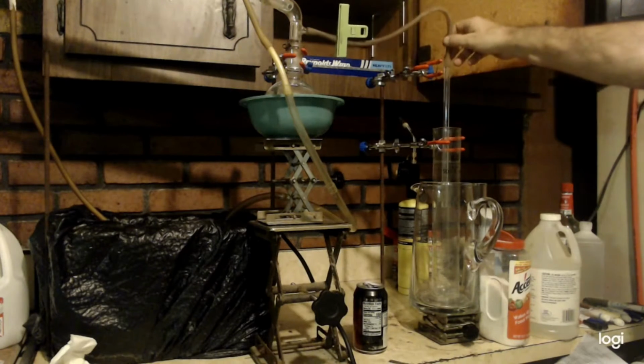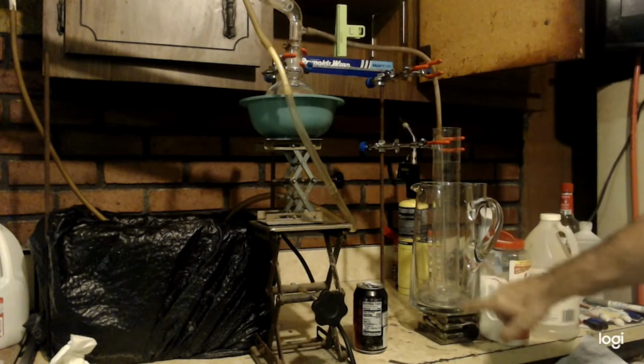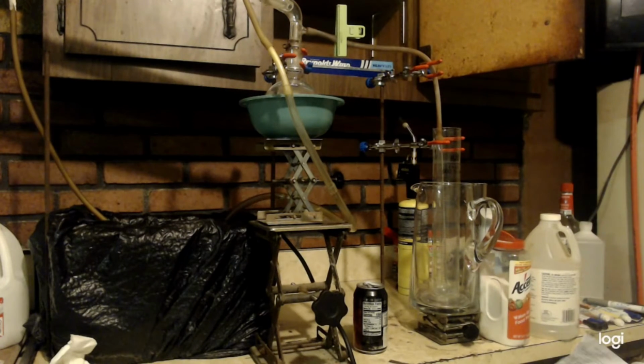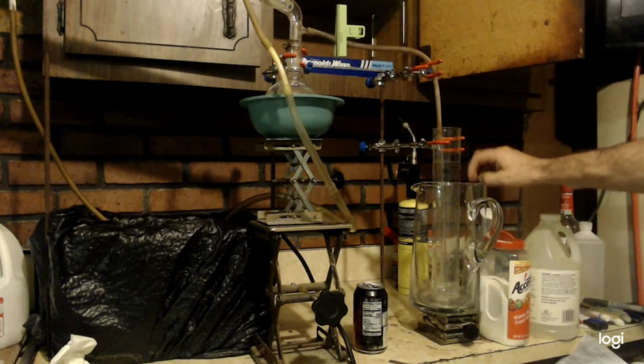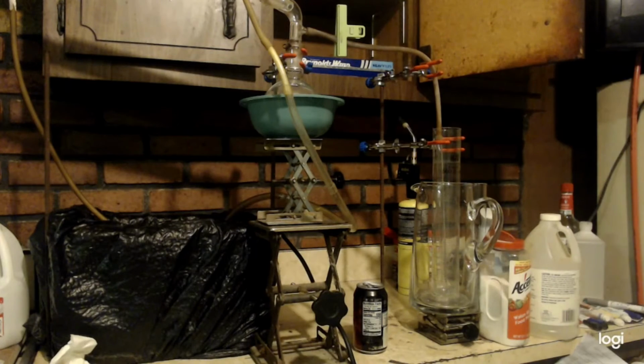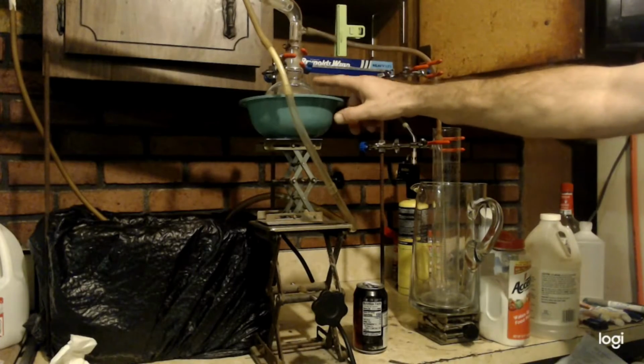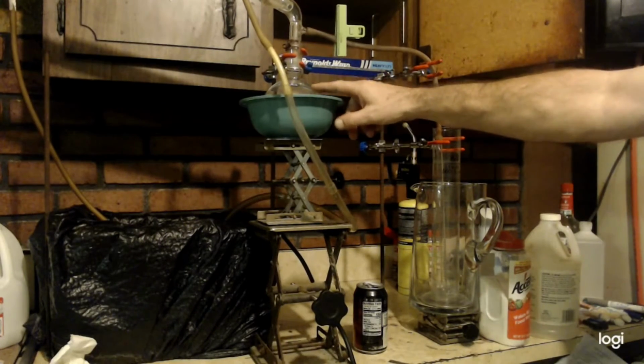And then I got it attached to a glass tube, which is almost to the bottom, but not quite. And then I have it inside this glass thingy, so I can put some ice in here just in case. This is where I'll put the hydrochloric acid in the water. And just in case there is anything that distills over, it can always be caught in here. You know what I mean?